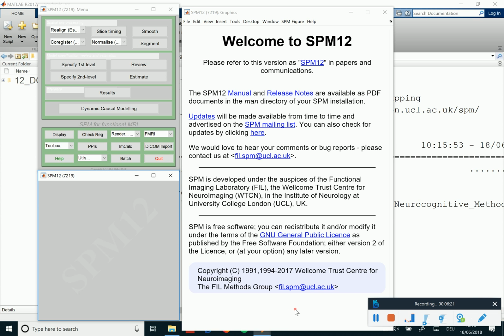And then to access the batch editor, which also allows you to simply write scripts, especially if you're starting a script from scratch, is here very prominently. It's the first thing that you see if you look at the interface, of course. So you can essentially ignore all of this, because all of these buttons that you see here you can also access via the batch interface.